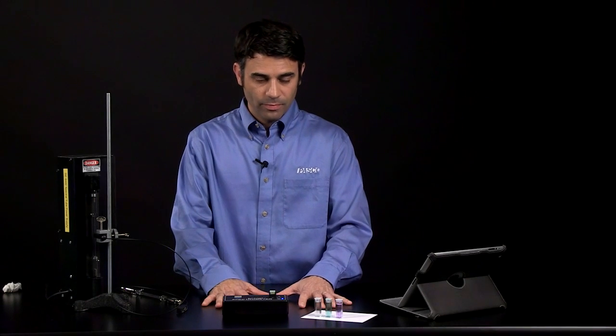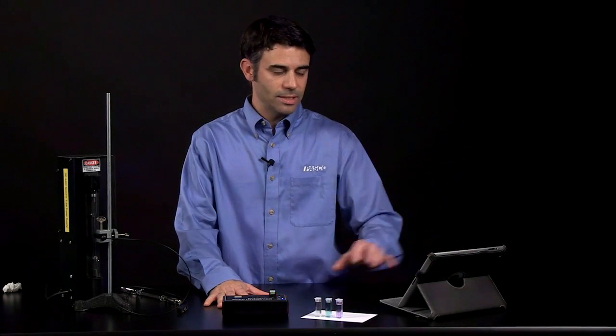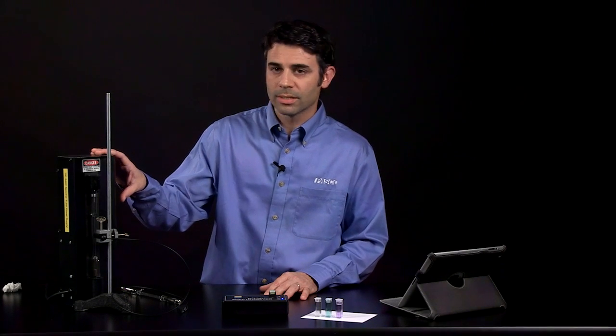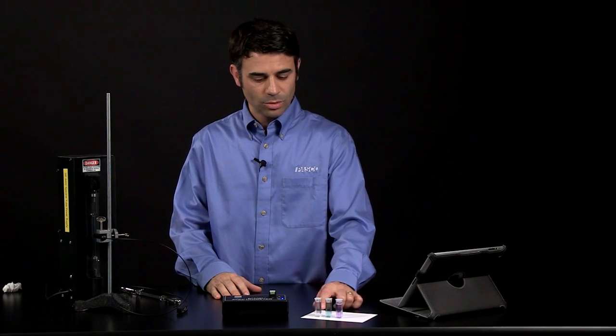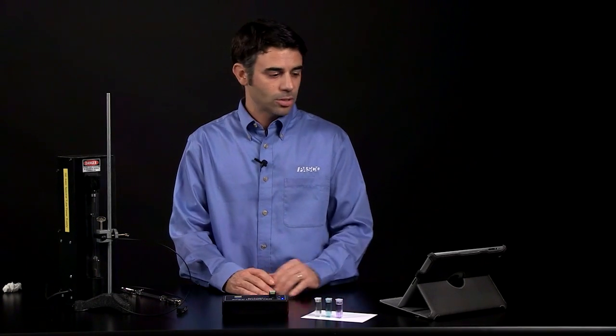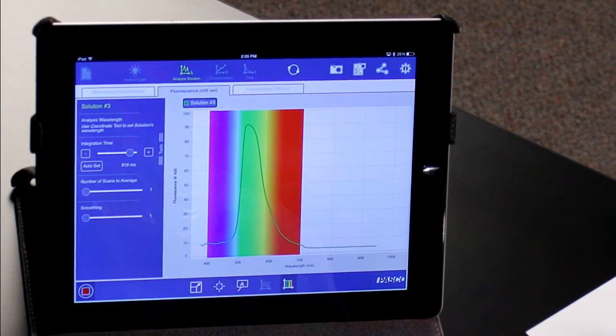So we have nice simple tools, very easy to get at the analysis, to do experiments analyzing light and analyzing solutions using the fiber optic accessory and some cuvettes. And later on, we can talk about how you can do some Beer's Law and kinetic studies using the PASCO spectrometer.